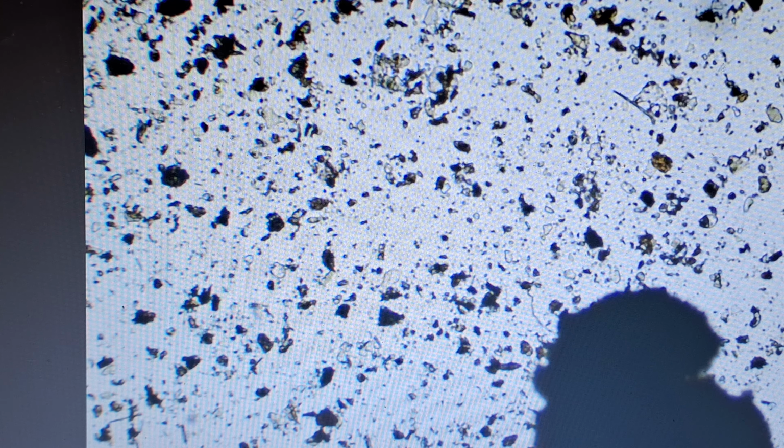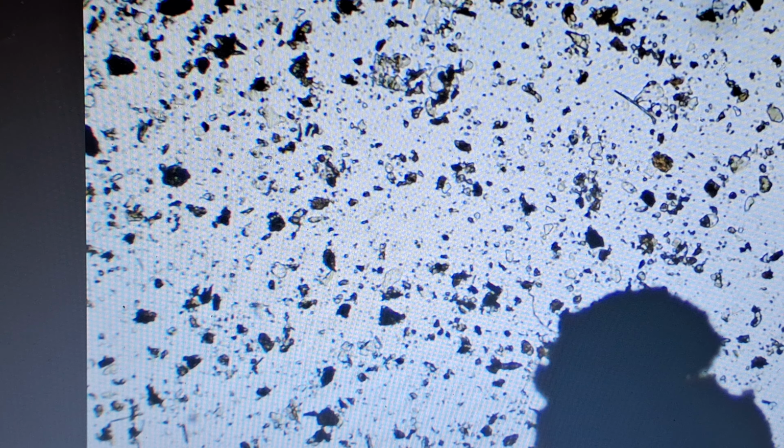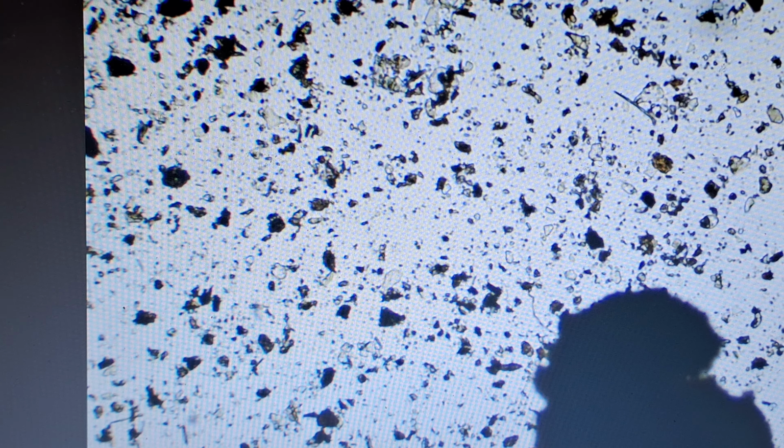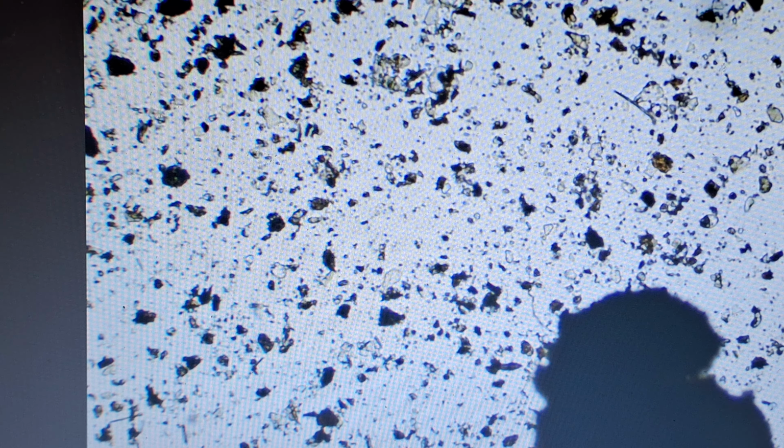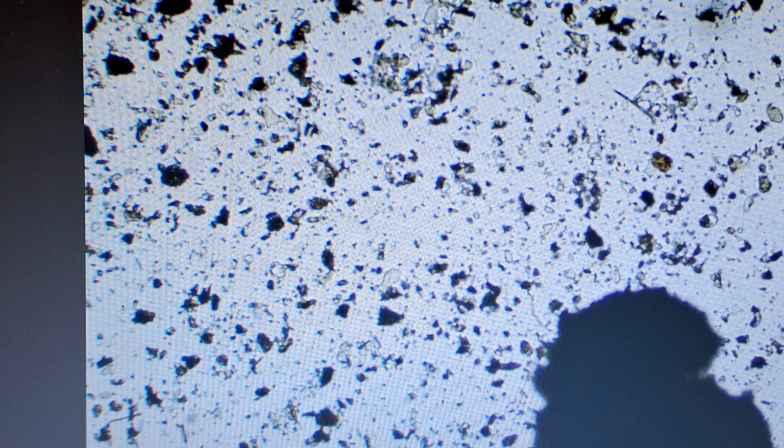This is actually some Fat Ninja Food Forest soil out of some of our planter beds. I'm sorry, our pots. We grow some potted plants in the summertime. I was in the microscope room looking at these, and I had a bit of compost tea left over from a few days, and I left it around, so it started to go anaerobic. I thought this would be a good time to show the difference in the two. So we're looking at this one here.